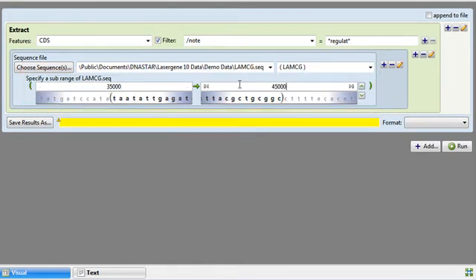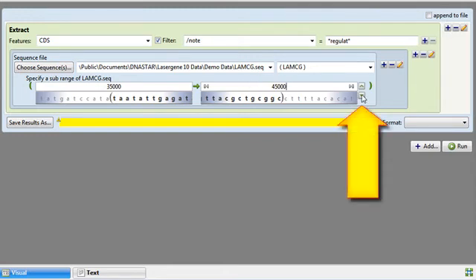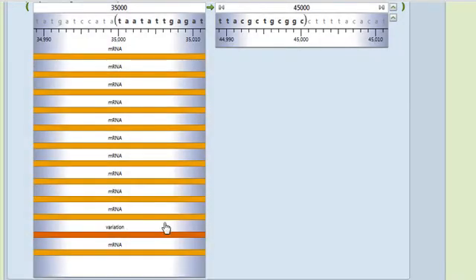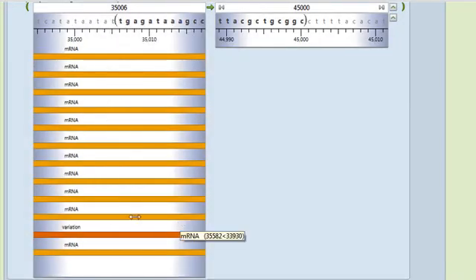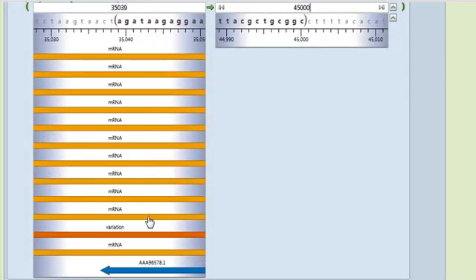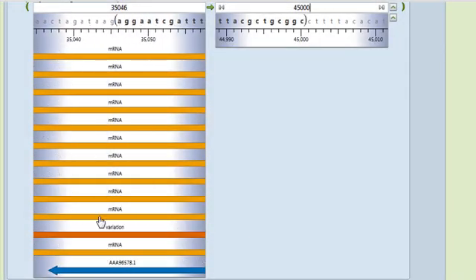To see the annotated features in this sequence, I can click the downward-pointing green arrow on the right. At this point I can use my mouse to scroll left or right and view the features along the sequence.